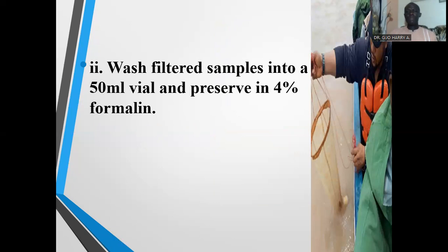The collected samples are now washed. We wash the filtered samples into a 50 ml vial and preserve in 4% formalin.